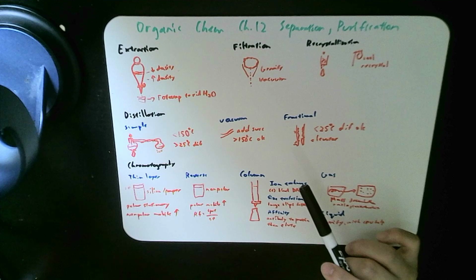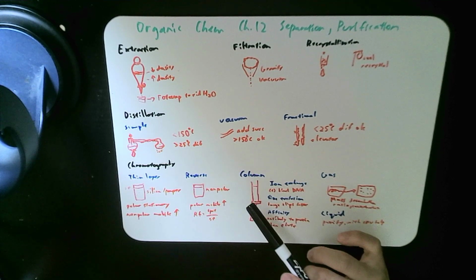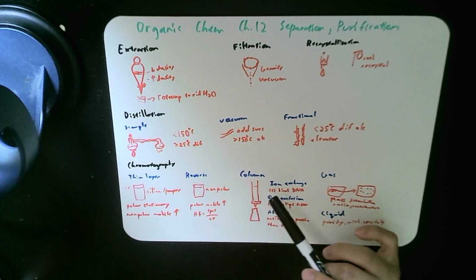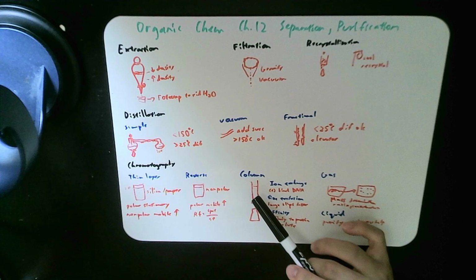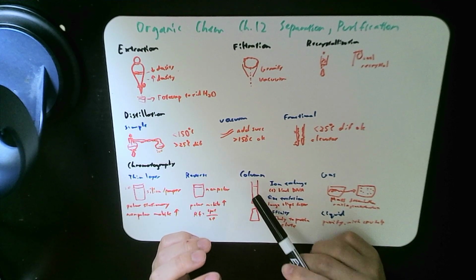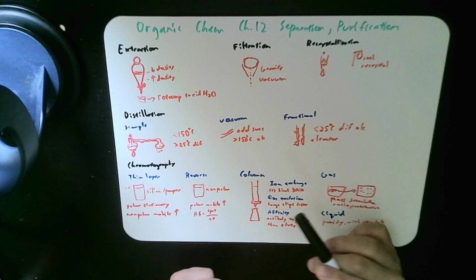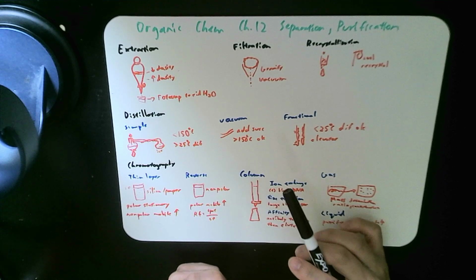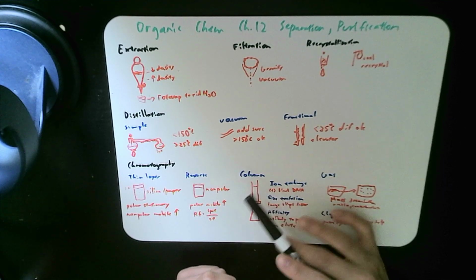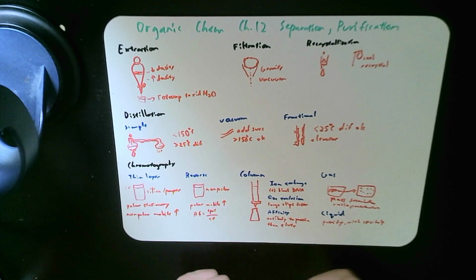For column chromatography, it's basically the same thing as thin layer, but you can pour in more things at a time. The silica gels or whatever gels you want to put in here, they stick and keep the compounds there, and whatever you don't need drips down, and then later you can get rid of the compounds from the beads by using an eluting molecule, like a salt, to pour it down and take them away from the beads.